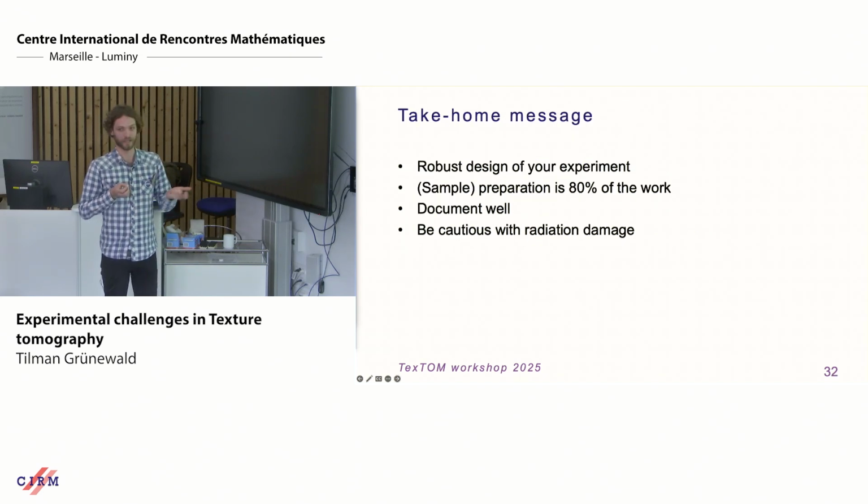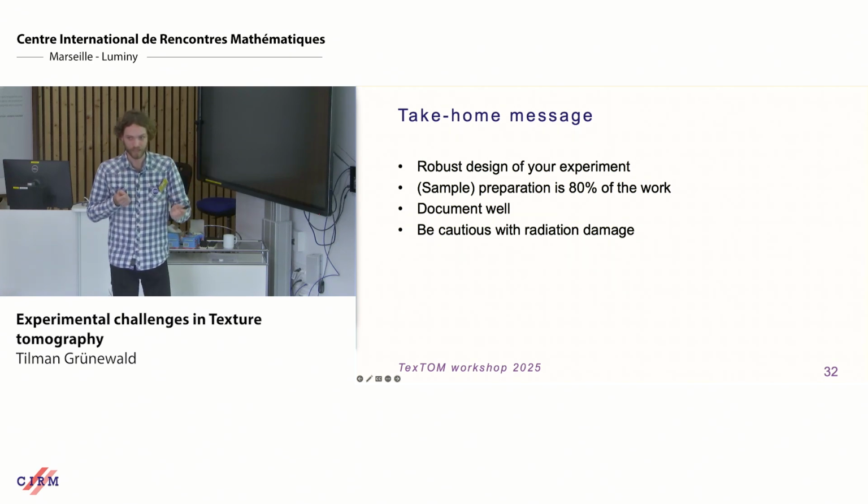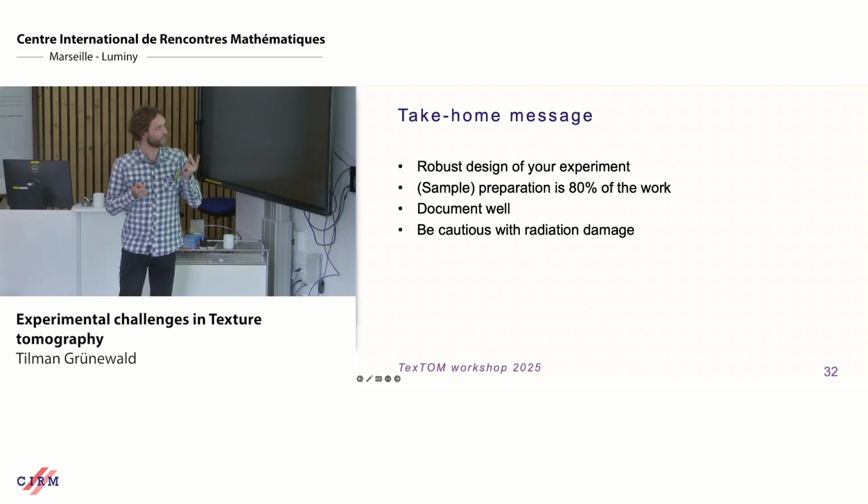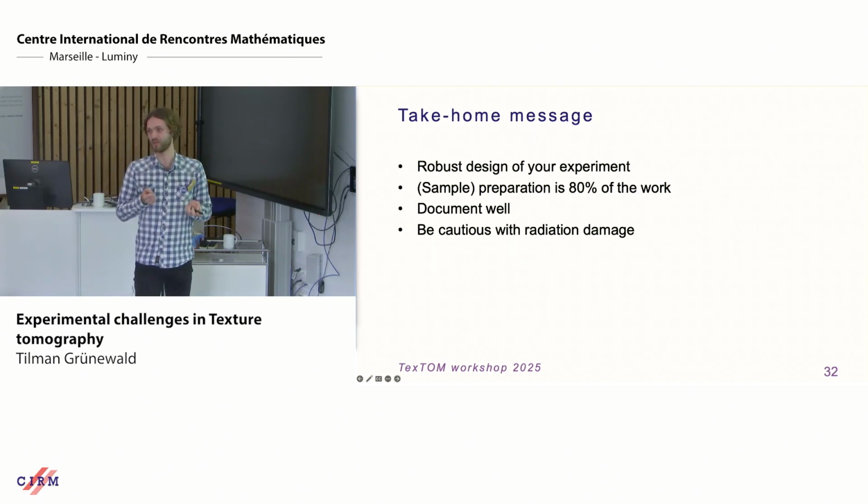And with this, I think I come to my last ranting take-home messages. Make a good design of your experiment. The sample preparation is most of the work. Document well, and be cautious with radiation damage.